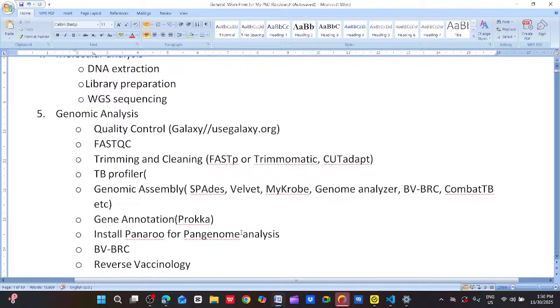That's what we want to compare, so as to identify the core genes, the accessory and the unique genes among and between different strains. Don't forget that this work actually started with at least three strains, which I told you two will still be coming, still under processing.